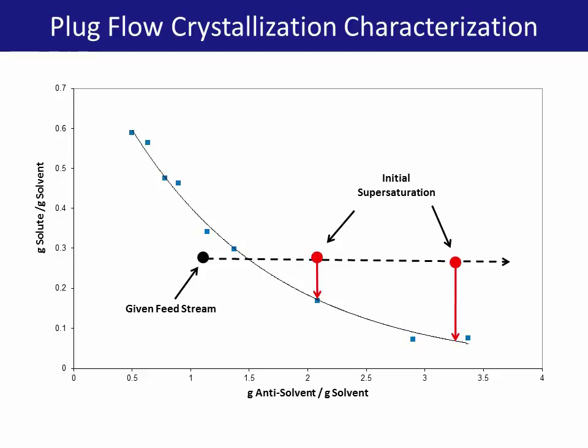Once the required crystallizer volume has been determined, in situ PAT can be used in order to empirically characterize or optimize the process. Plug flow crystallizations, such as this one, are suited to producing small and narrowly distributed crystal size distributions in order to meet bioavailability requirements for formulation without the need for milling. However, once these requirements are met, further reduction in mean crystal size may unnecessarily impact on downstream processing. In situ FBRM allows rapid process characterization so that an optimal crystallization design in terms of crystal size, downstream processing, and maximizing productivity can be found.